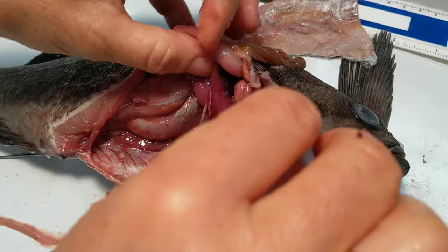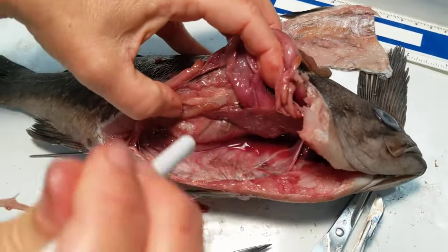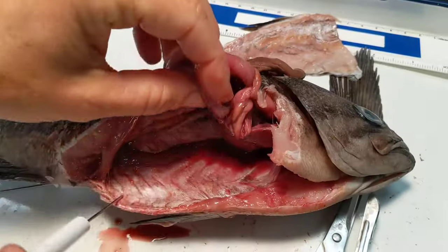We can still see a little bit of the swim bladder blown up. I think that's about it for now.